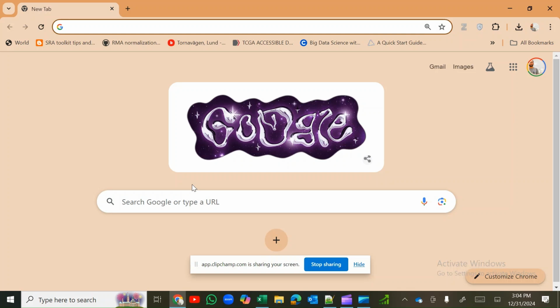Hello everyone. In today's tutorial, we will talk about how to download the genomic coordinates of a specific gene. The genomic coordinates may include the exonic regions and the intronic regions. This challenge comes for bioinformaticians or biologists who have multiple gene sequences and want to know a specific exonic region or intronic region, and it's difficult doing it manually.